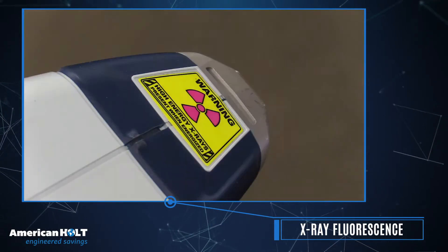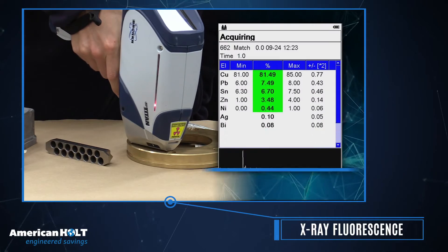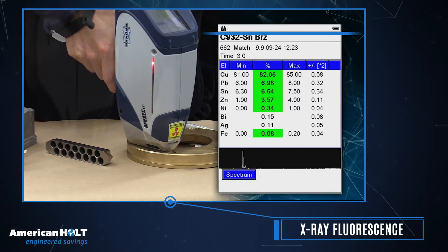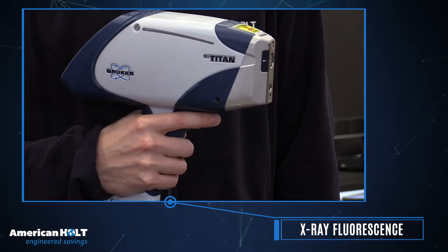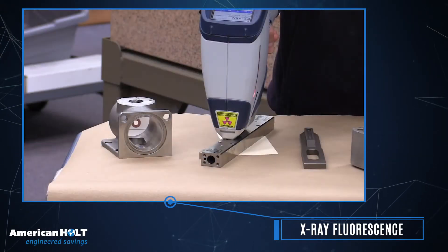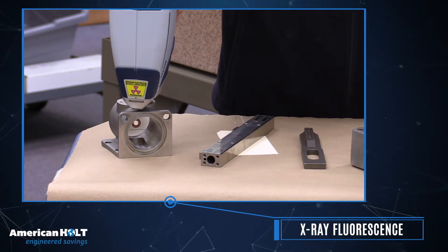The XRF device uses X-rays to measure an object's elemental composition, which is compared against an extensive materials library to identify the exact materials used. Our portable XRF can be used on samples of any size or shape, produces results in seconds, and is completely non-destructive.